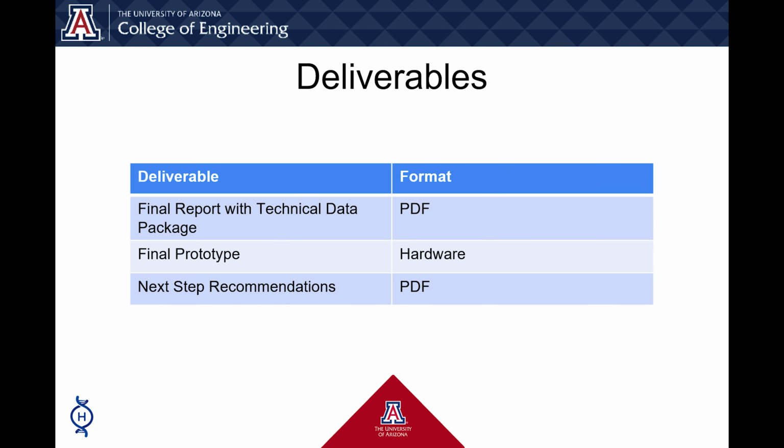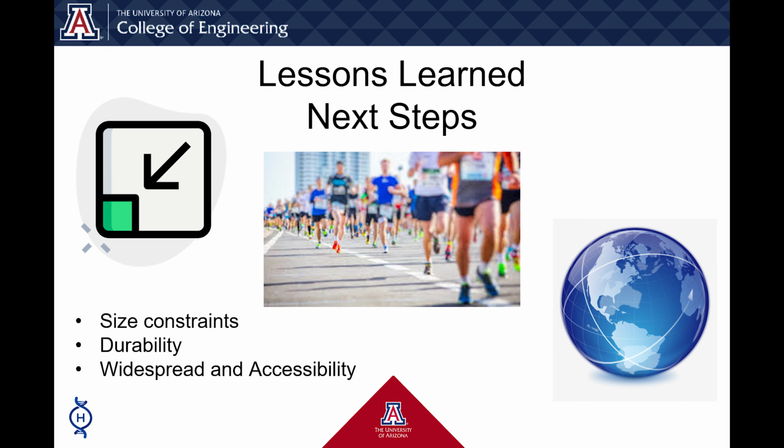Here's a brief look at our deliverables for this project. We want to give Roche the ability to recreate our success while also providing them with our idea of the best path forward. Embarking on this project and the development of the histohelix has provided key insights and direction for future advancements. Precision in prototyping matters, but so does size. In the future, it will be important to think about a more compact design without sacrificing functionality when refining our prototype. Making the module smaller will ensure it fits seamlessly into Roche's interfaces, maximizing its utility.